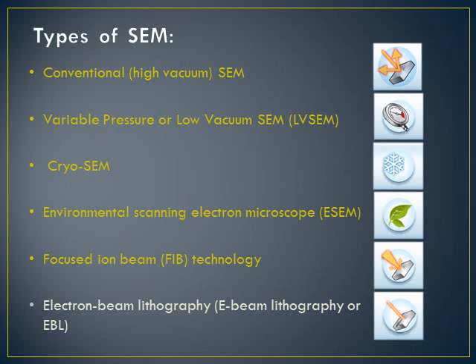These sections can be taken off as sequential sections, each viewed in turn with the SEM mode, and this imaging information used to construct a 3D image. Machines can have both ion and electron columns on a single instrument, called dual beam instruments.